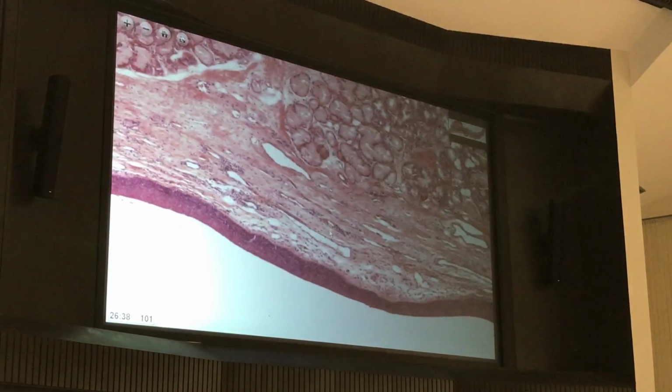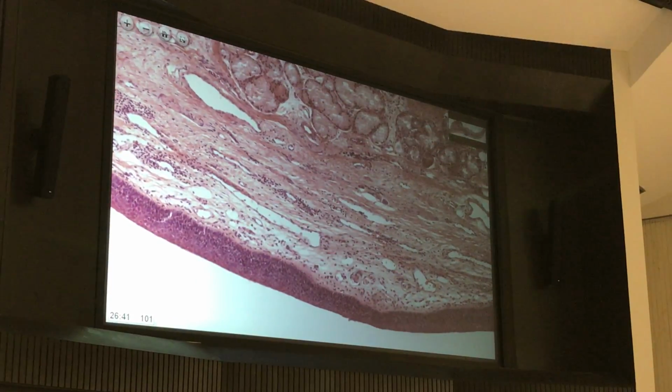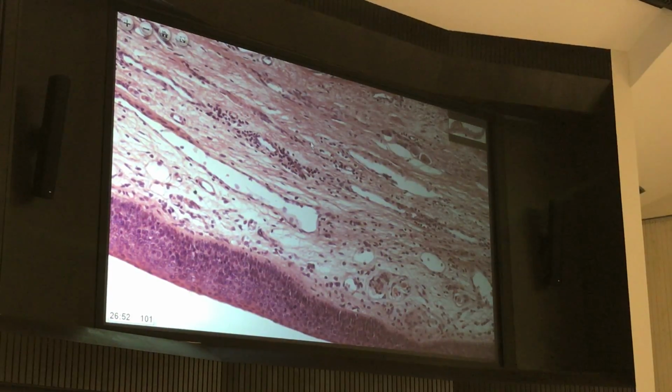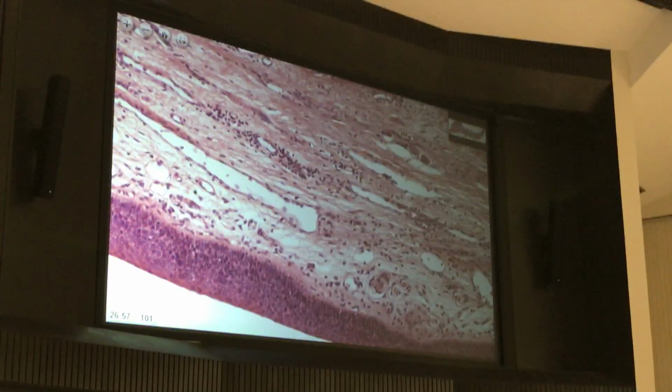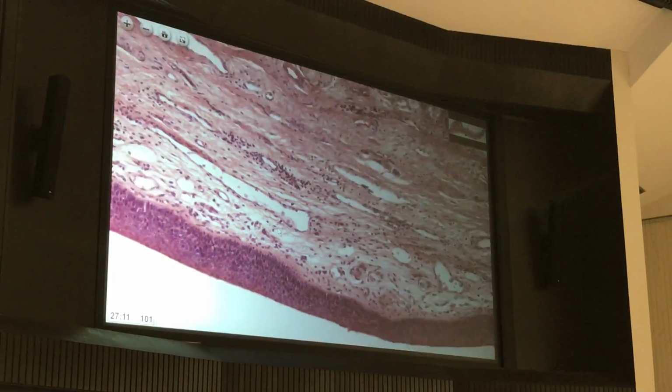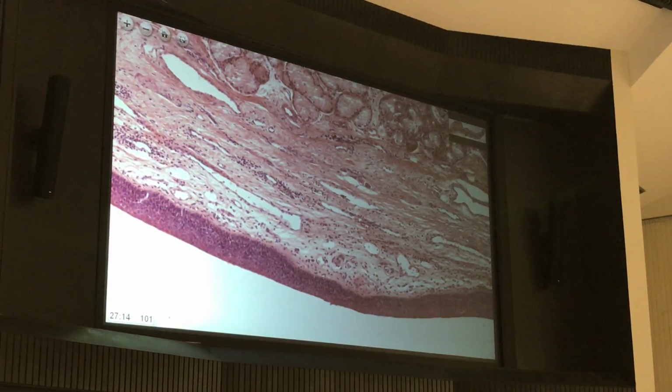Looking at this connective tissue, what would you classify this area here? Loose, and then this area here? Dense. This is common as well, especially in the oral cavity, the lower end of our GI tract and the reproductive tract. Right under the epithelium, you'll see a little looser connective tissue, and that's where a lot of your white blood cells will be roaming around, and then it'll get denser. So there's no border, but this is real common. Right underneath you'll see a looser layer, and then it'll get denser.